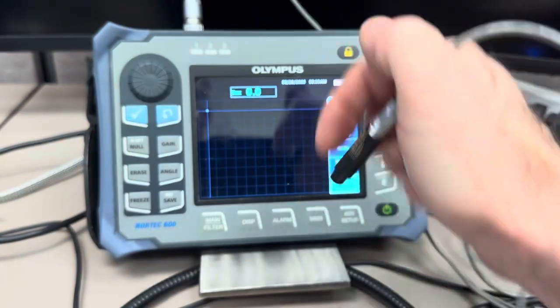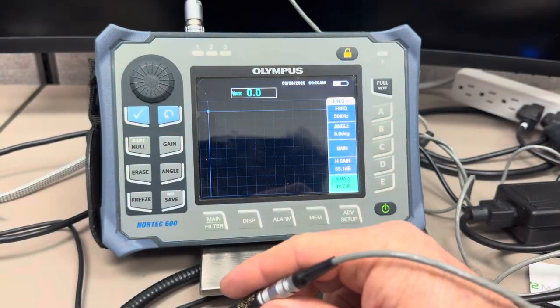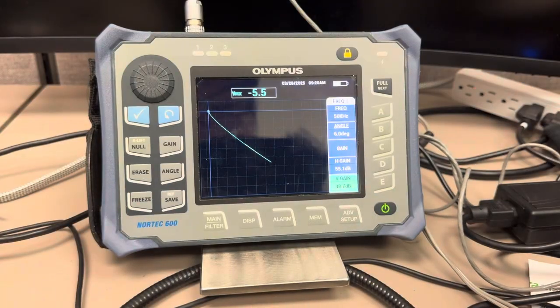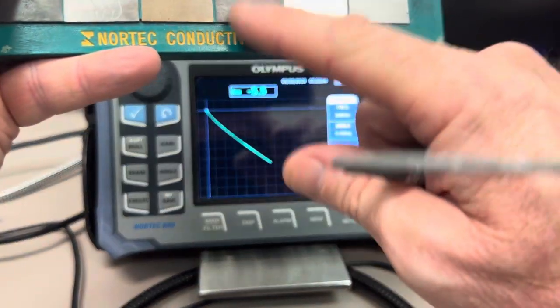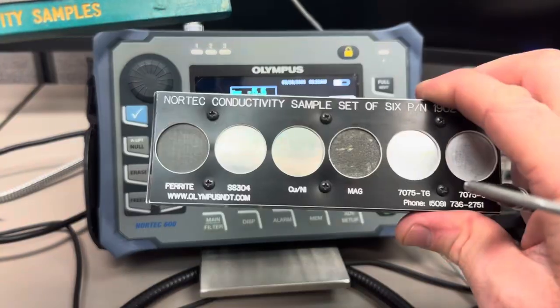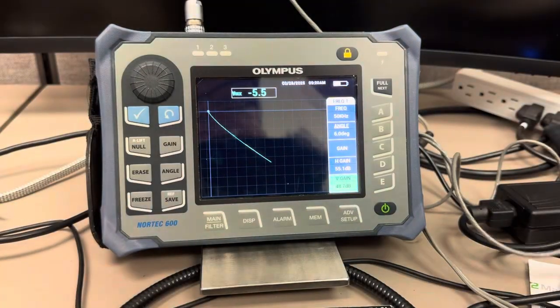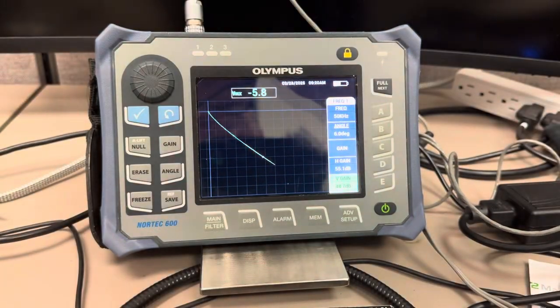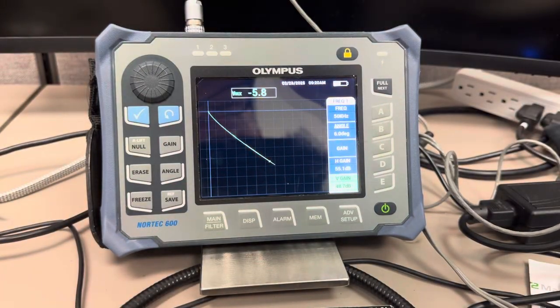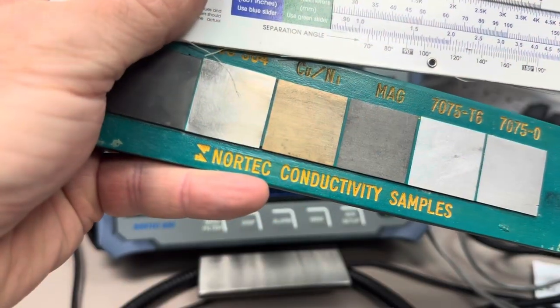Let's test out this. We'll go to the third over from ferrite. What do you think that is? Well. That looks about the same color as magnesium. Is that magnesium? Let's touch it and find out. I'm going to touch it. Ready? Follows the same exact line. That's because that's magnesium. See it?